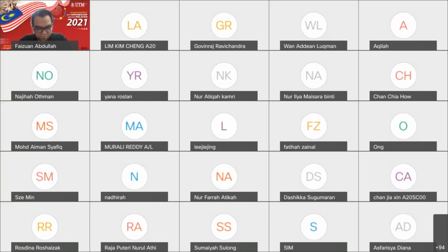The exact amount of sample that I put in all the calibration solution series for the standard addition, X, in the procedure is 20 ml. Am I correct? You can read in procedure C: pipette 20 ml of the water sample to each flask and finally add the deionized water.